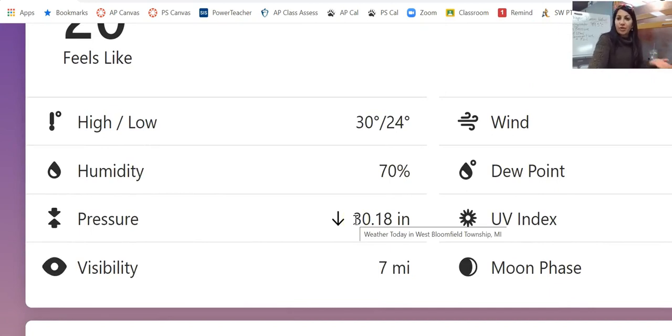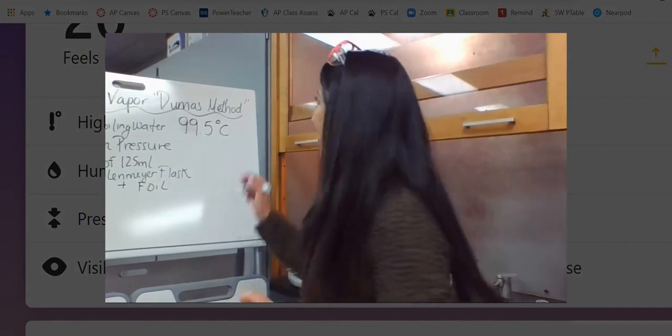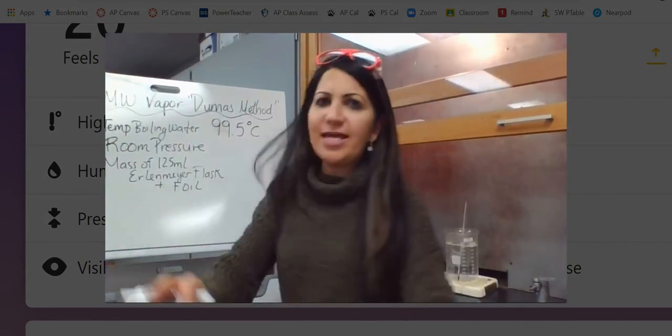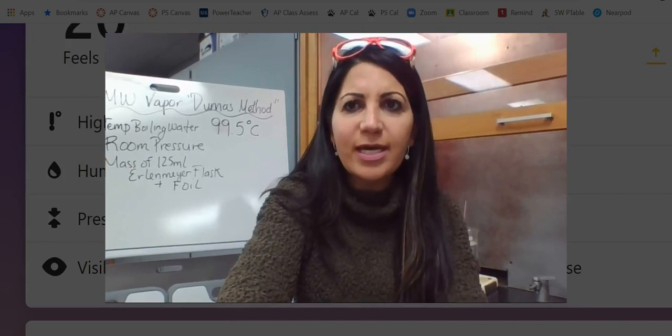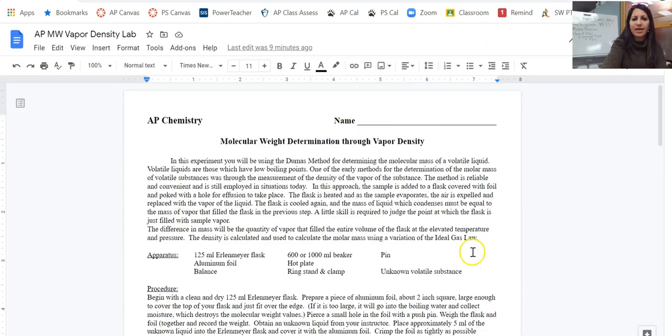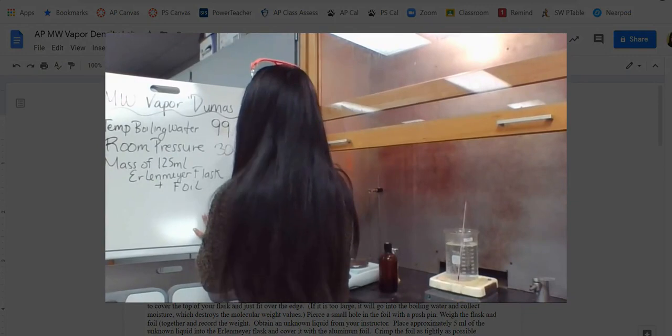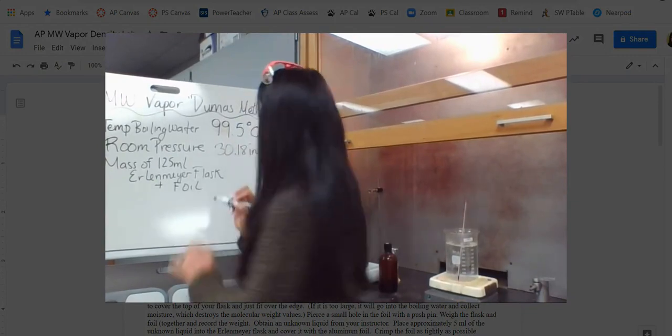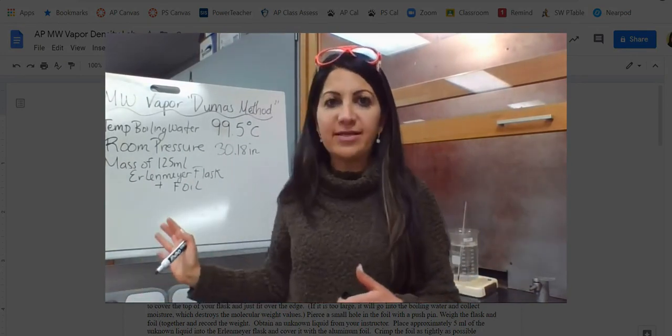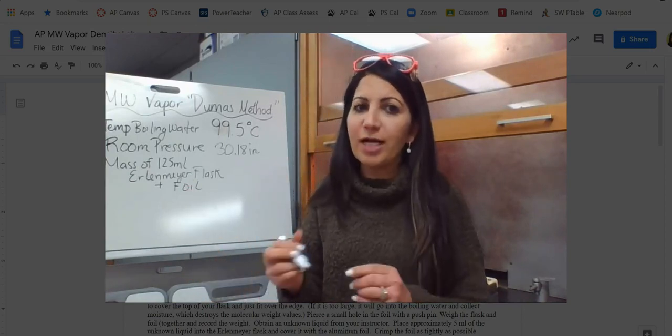And it looks like we've got a pressure of 30.18 inches. Now, it could be different, so you're going to want to make sure that you get the value for that particular day, for that day, in order to do your calculations. But I'm going to go ahead and I'm going to write down here. I've got the temperature of my boiling water. So let's enlarge this here. Temperature of the boiling water I have is 99.5 degrees Celsius. And then I have the room pressure. We said 30 point, let me just double check it real quick. It looks like it is 30.18 inches. So let's get that down as well. So don't forget, you're going to need to do a conversion for that and show your conversion. So in your data table, you're going to organize your data table. You want to make sure that your data table doesn't have calculated data. So it's supposed to be raw data.